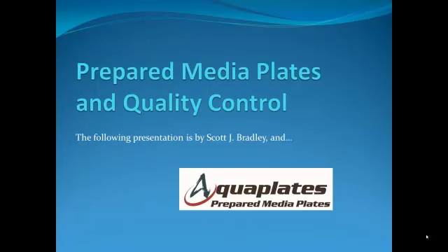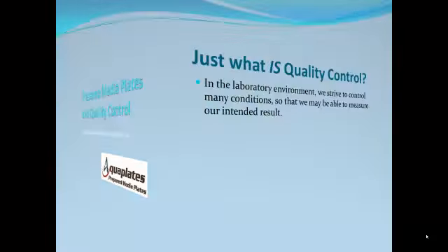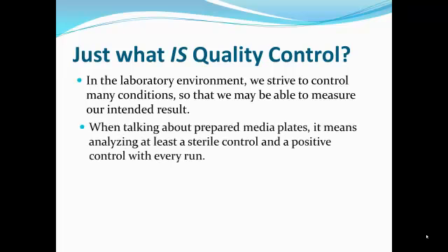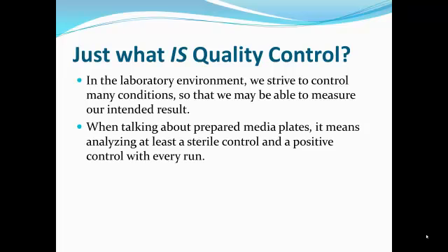Prepared Media Plates and Quality Control. So, just what is quality control? In the laboratory environment, we strive to control many conditions so that we may be able to measure our intended result. When talking about prepared media plates, it means analyzing at least a sterile control and a positive control with every run.